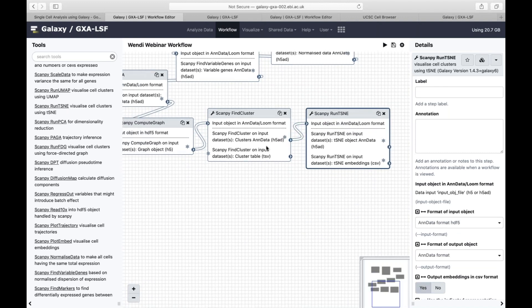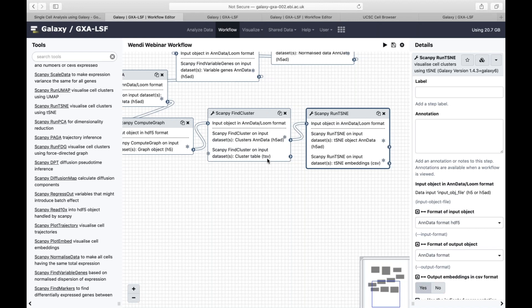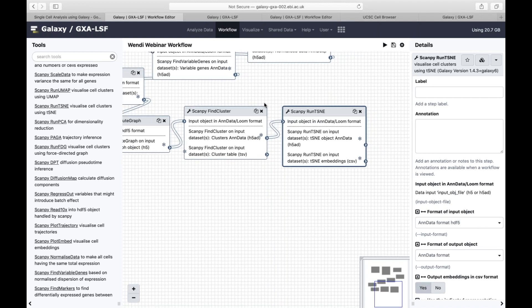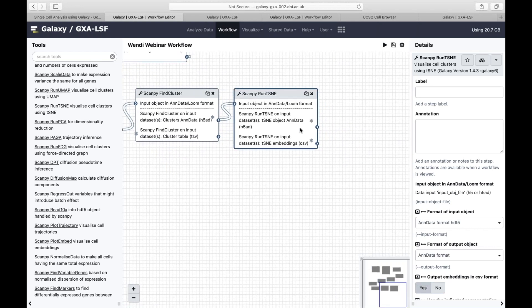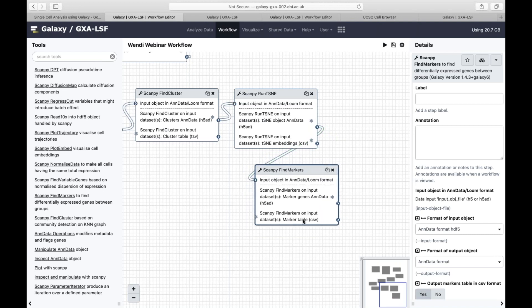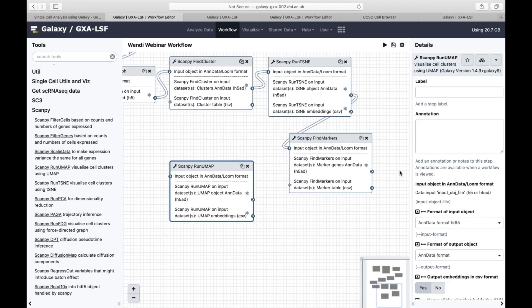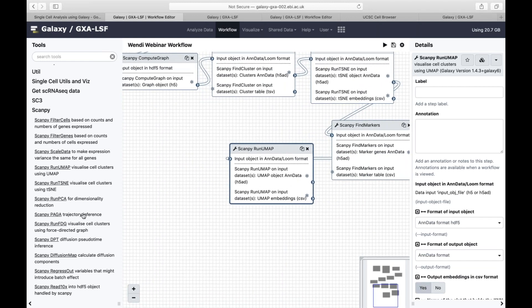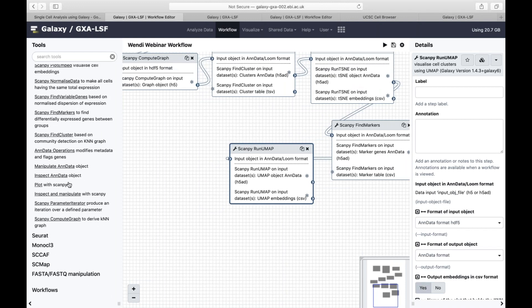This is a great example of how you get data out. You'll see input at the top and output at the bottom. In this case we have the output object you can analyze further, plus a cluster table — a t-SNE table which you can open to see information about each row in your dataset, something you can inspect along the way. We can then find markers, which gives you a table of your genes in addition to the data with marker and gene information. Then we can run a UMAP — everyone's excited about UMAPs nowadays, with t-SNEs slowly being phased out.